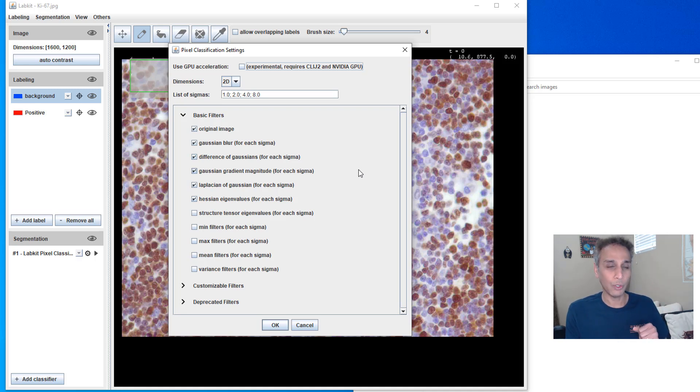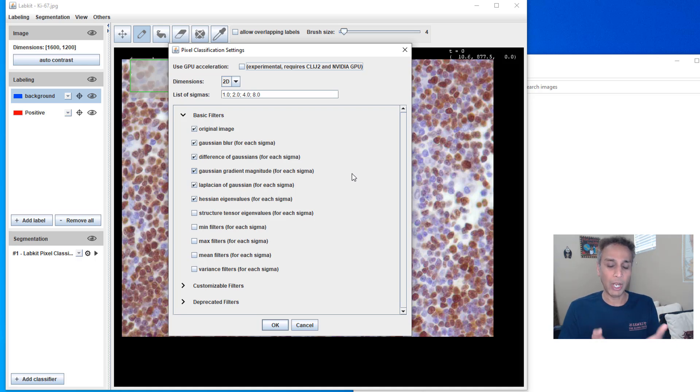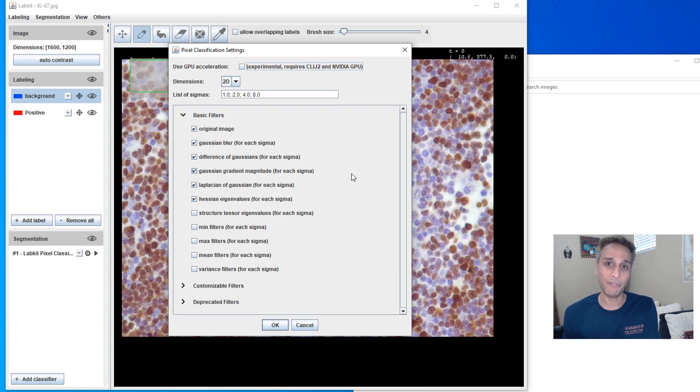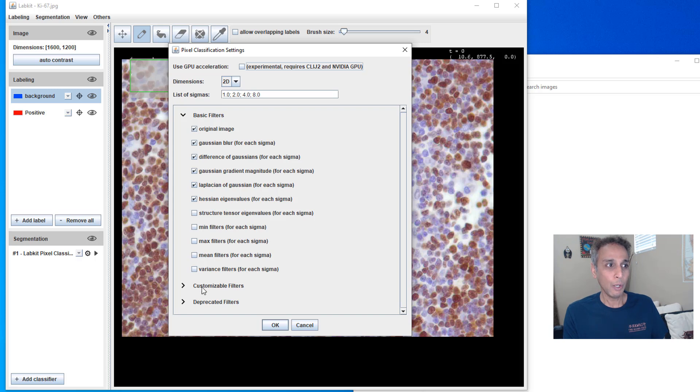How did we do that? We extracted features, a whole bunch of features, and we applied random forest classifier to segment our image. This is exactly what that is. Here, these are all the features. What features do you want to use, like Gaussian and Laplacian? You can add more filters if you want.